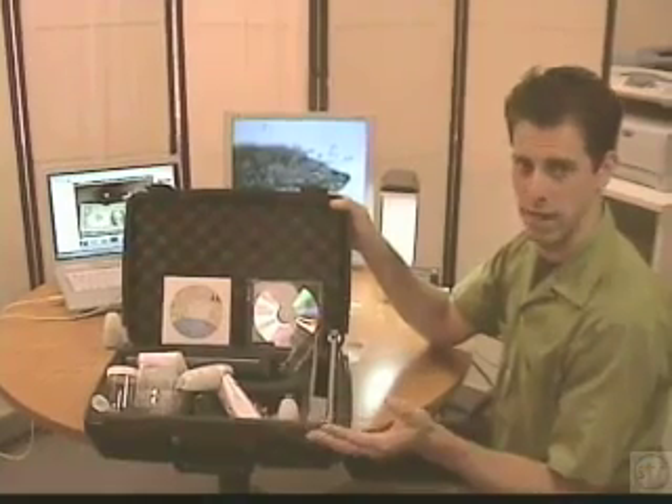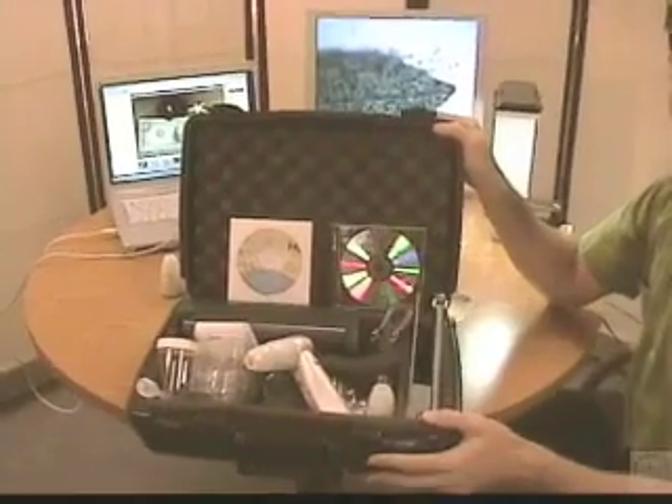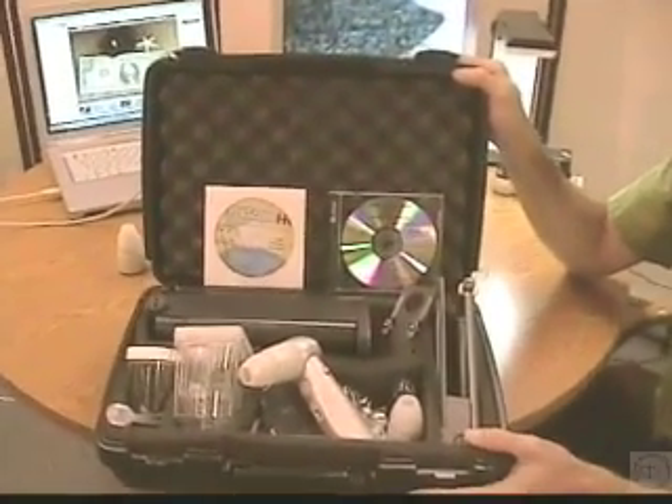Hi, I'm Mark Hoffman with STR, School Technology Resources. In this video, we're going to take a look at the ProScope HR and the Scope on a Rope L2 camera. This is one of our exclusive education kits available from STR.